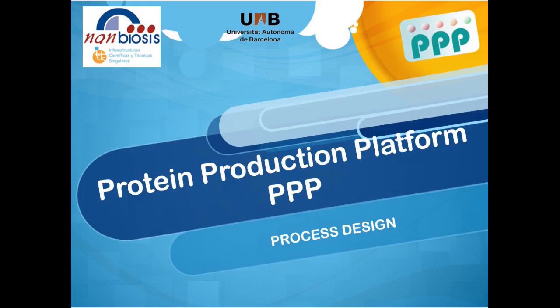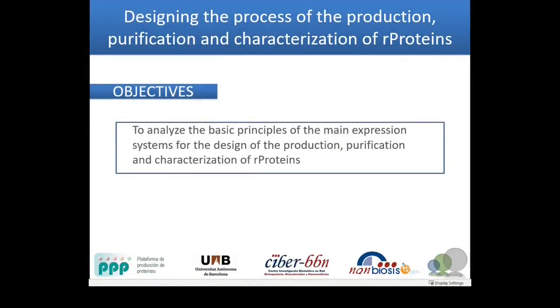Process design. When dealing with the production of a recombinant protein, it's necessary to analyze the basic principles of the main expression systems that are available in the laboratory in order to design a proper procedure for the production, purification, and characterization of the recombinant protein.